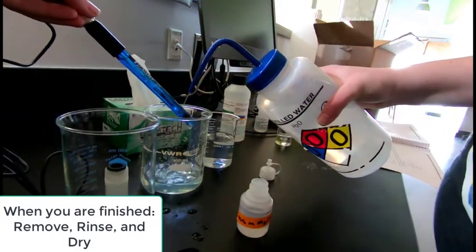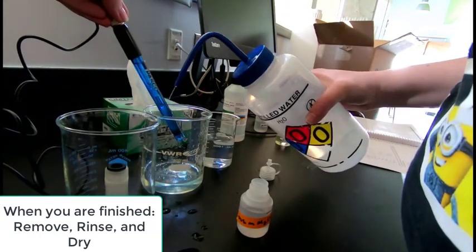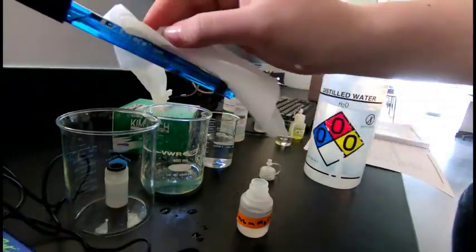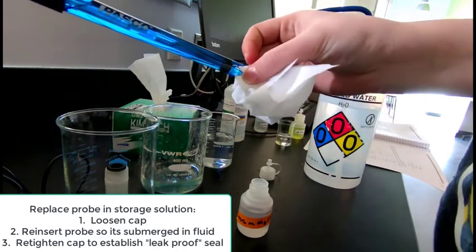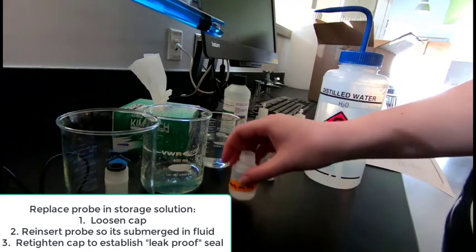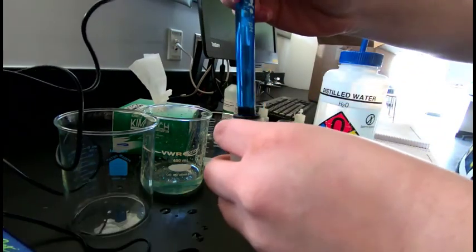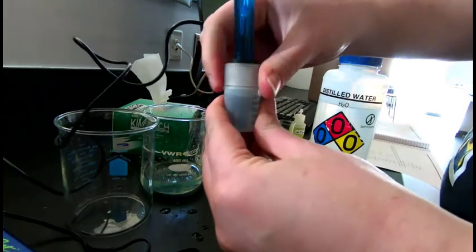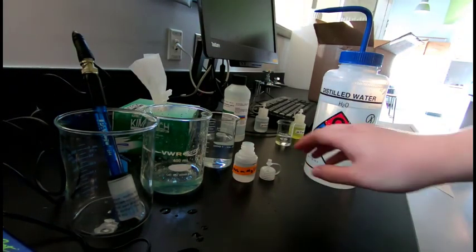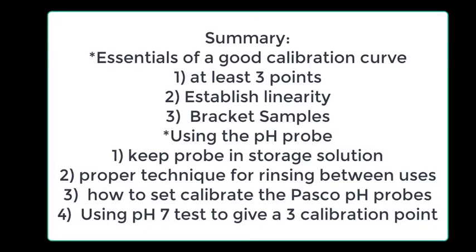So when you're done with the pH probe for the day, what you want to do is the same. Remove, rinse, and rinse it well. And then you're going to dry it off again with the chem wipes. We do more blotting than we do rubbing. And the last step is you want to put it back in the storage solution. So you want to loosen that cap up a little bit. That'll allow that O-ring to be open. You can replace that pH probe in there. Make sure it's below the solution level. And then when you tighten the cap, it's going to re-tighten the O-ring so that it's waterproof. And now you can store that. And if it falls over, you won't lose liquid. And then the inner liquid inside the pH probe won't leak out.